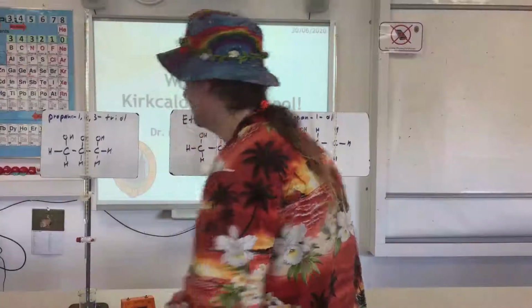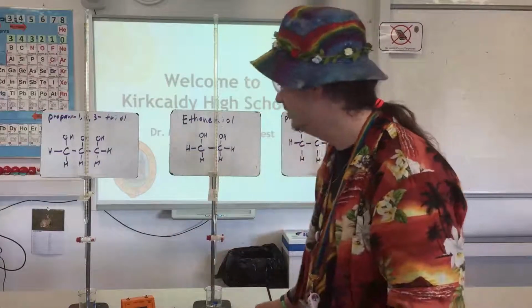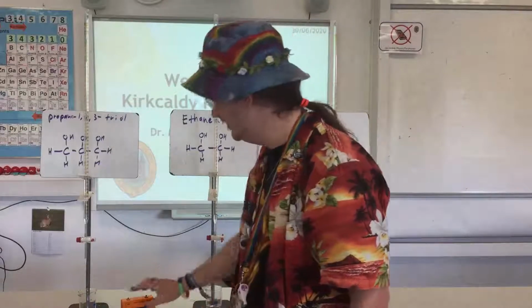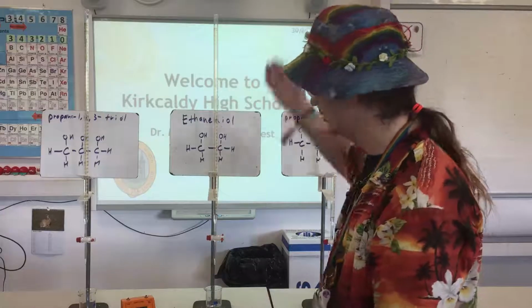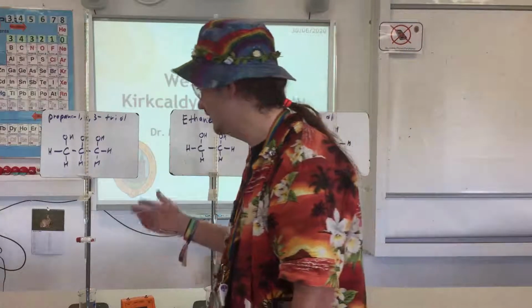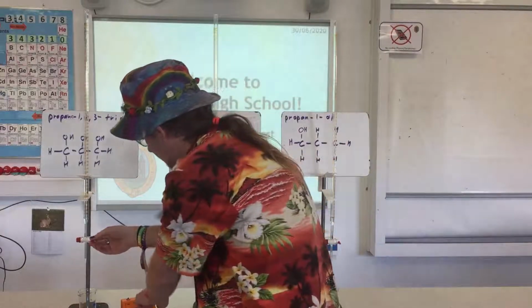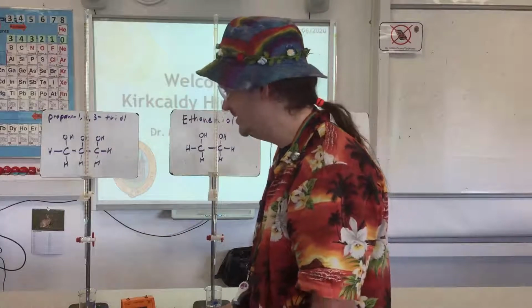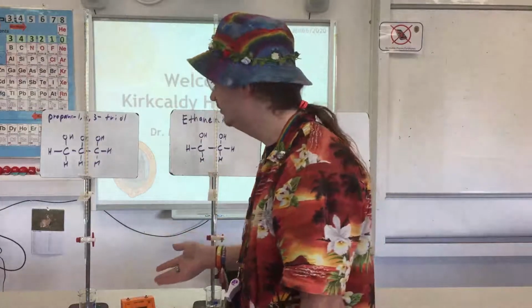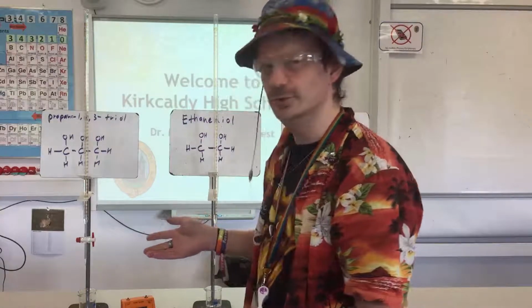And finally, we're going to do the glycerol. So this has got three hydrogen bonding sites, three hydroxyl groups there. So we're expecting this one to take a lot longer than either of these two. We've gone from 40 seconds with the first one, 77 seconds with the second one. So let's see what happens with the third one. On goes my tap, and that's my timer started. And again, we have very, very slow flow here. In fact, it's so slow, I might have to just go to the pub or something.